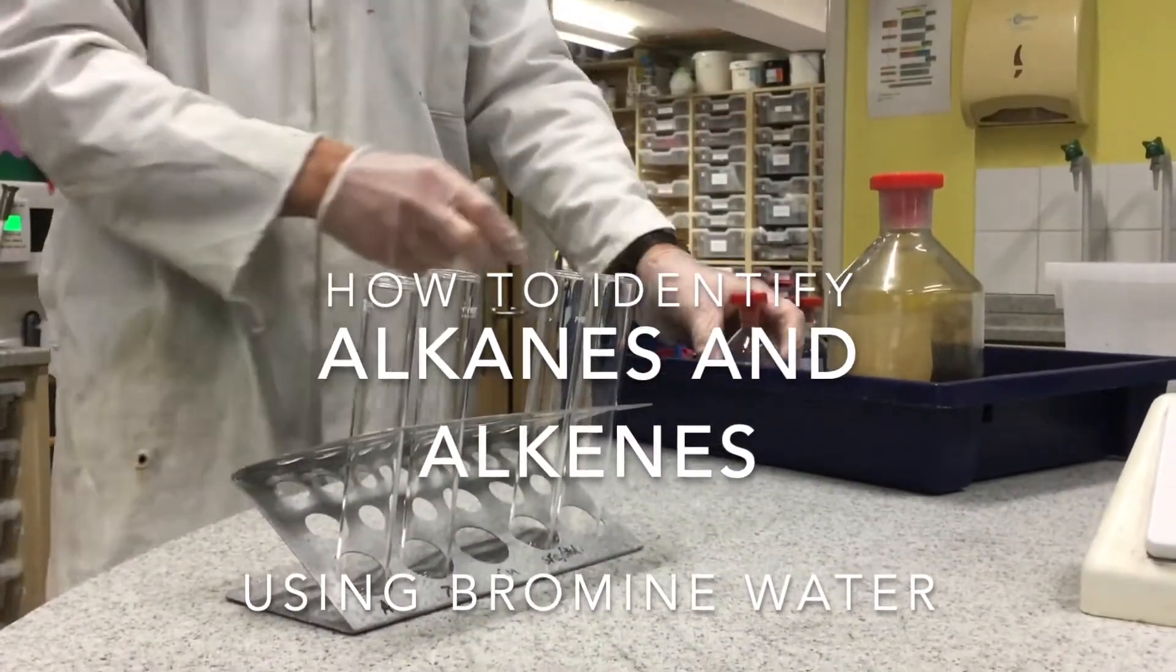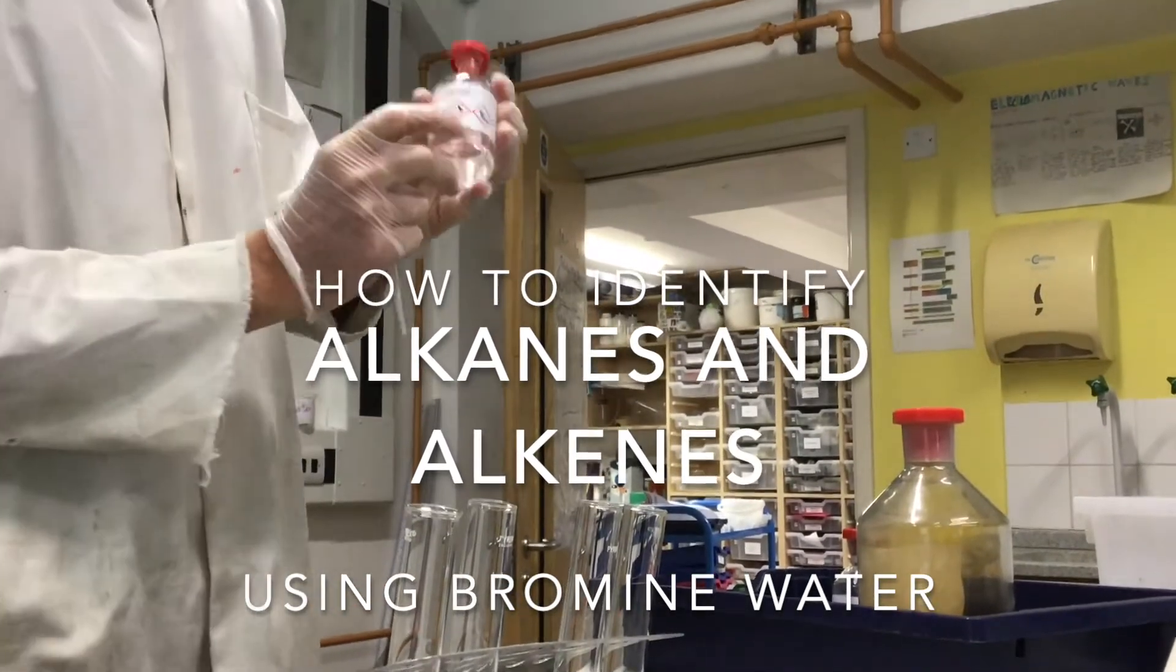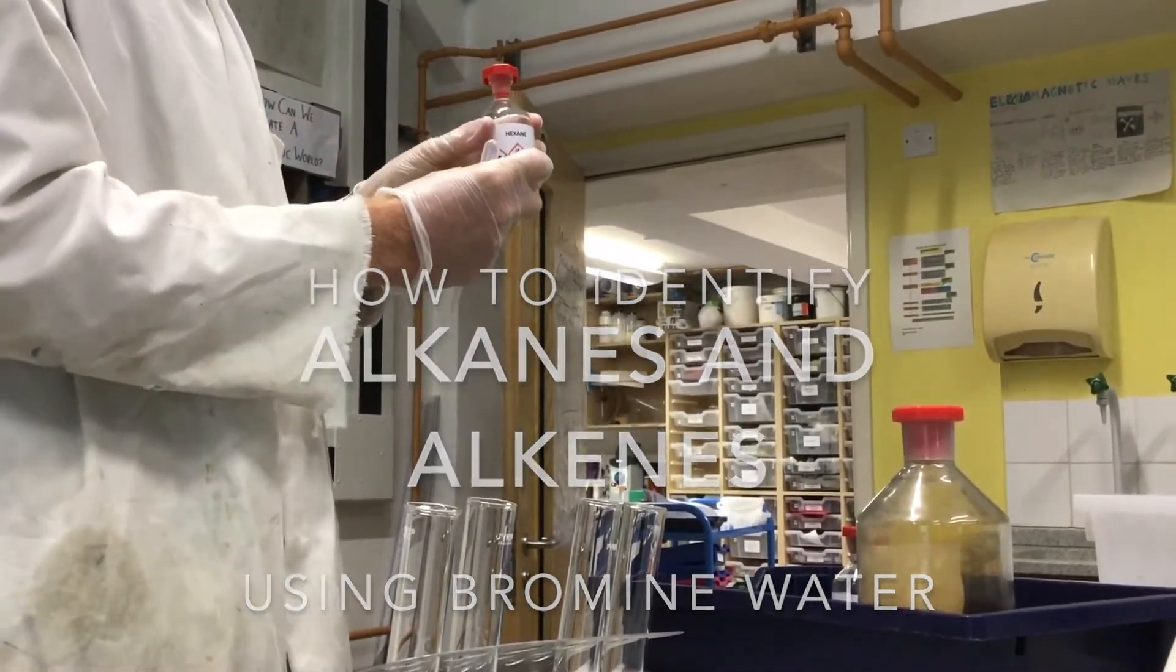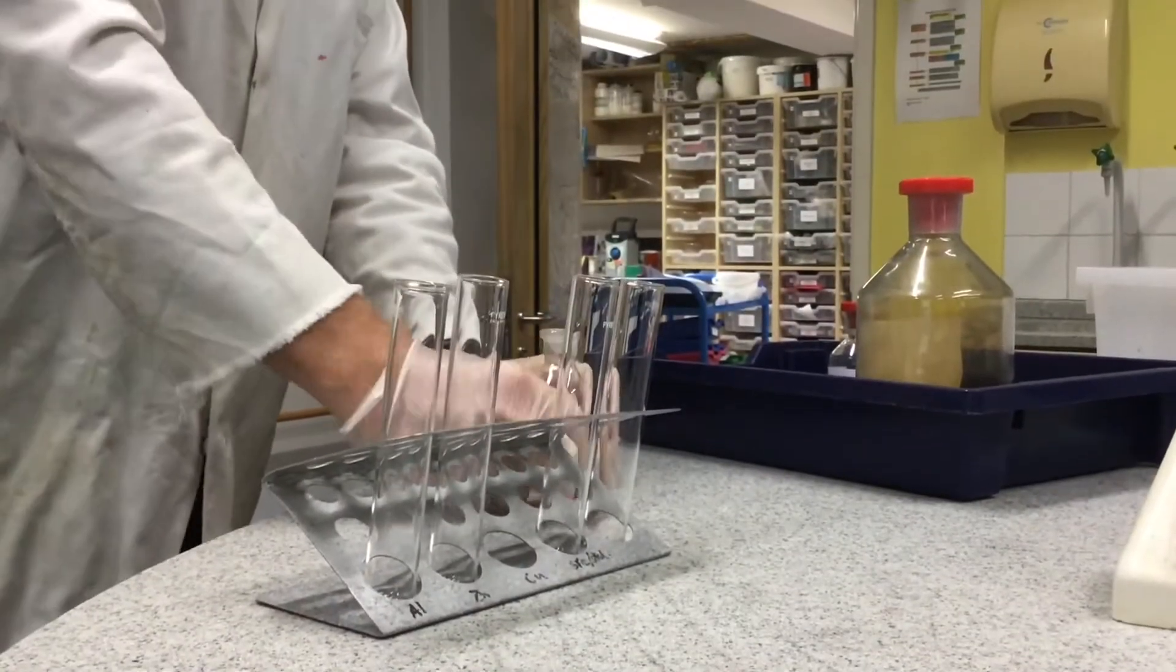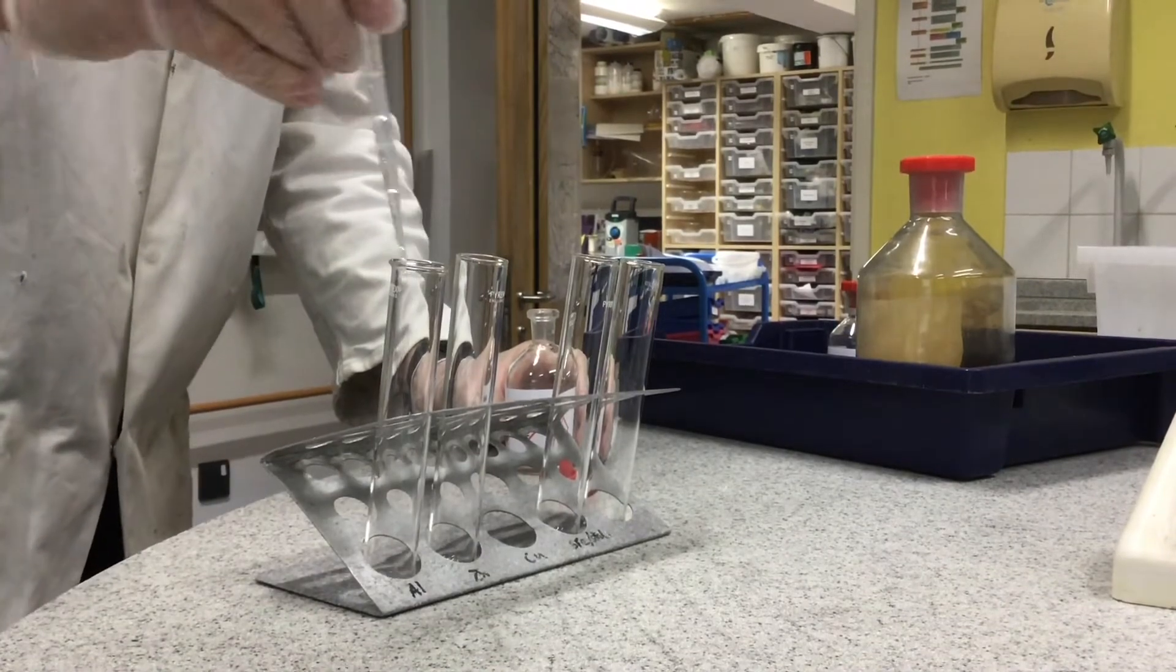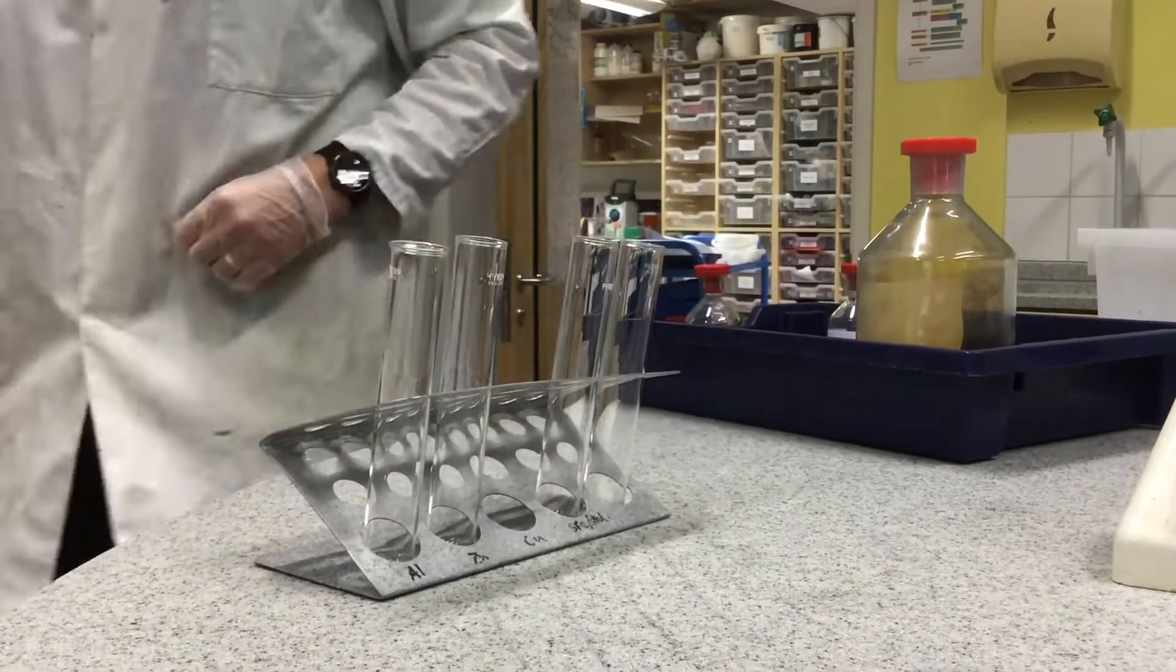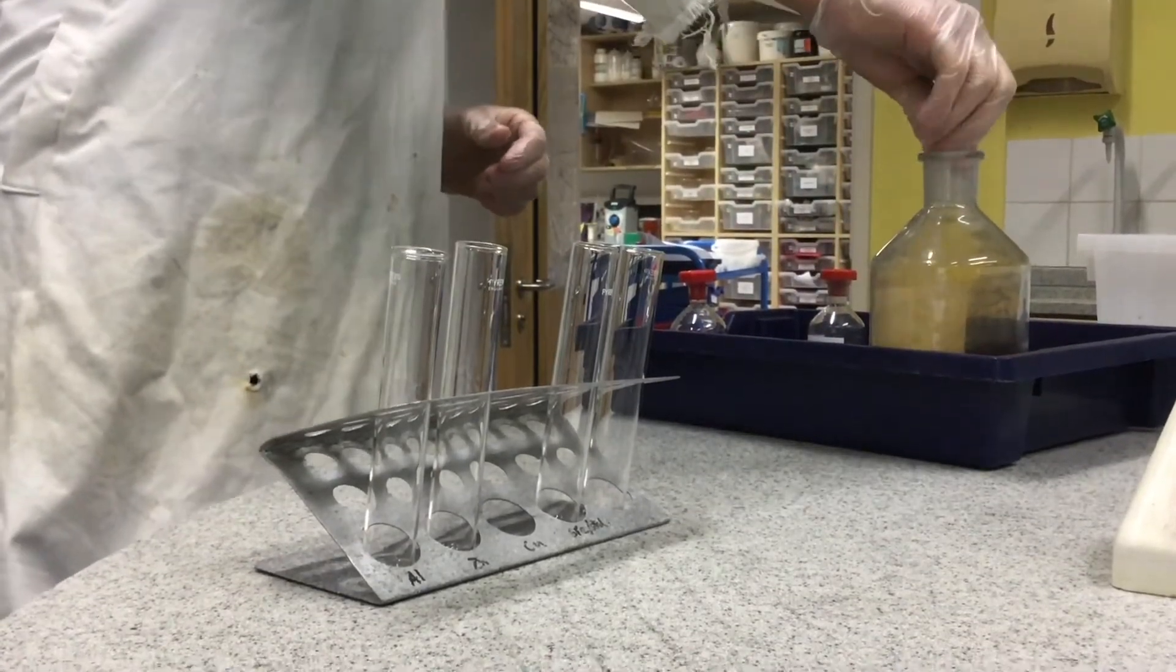Here's what happens when you use an addition reaction to identify an alkane from an alkene using bromine water. So I'm going to put some unidentified substance. I'm going to test very small amounts, 10 drops, and then I'm going to put in some very dilute bromine water.